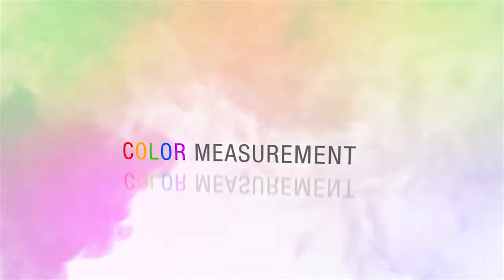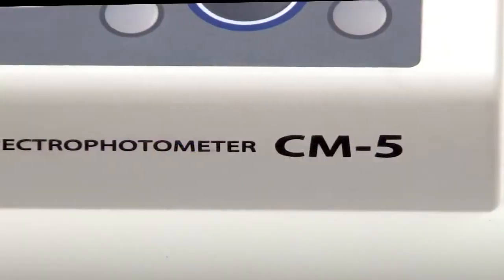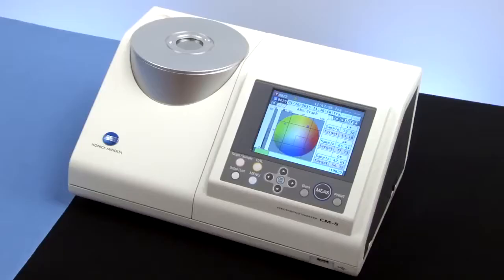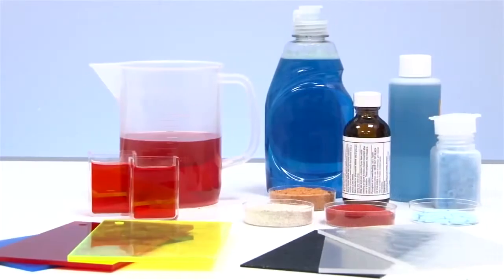Konica Minolta Sensing, the leading manufacturer of color measurement instruments, offers the CM5 Benchtop Spectrophotometer, a vital tool in research and development, quality assurance, and laboratory testing.